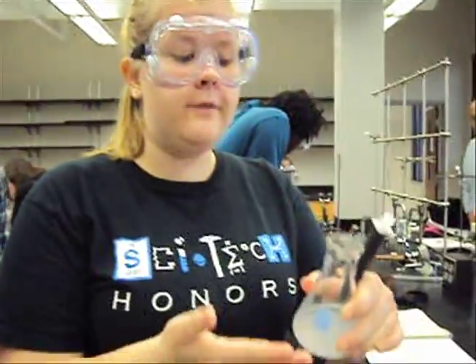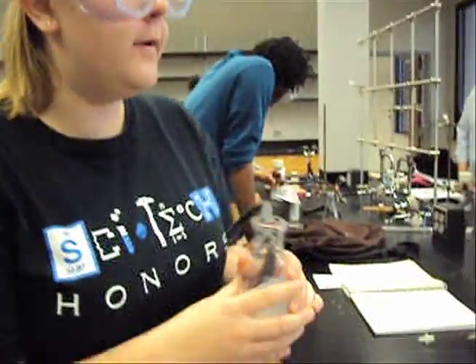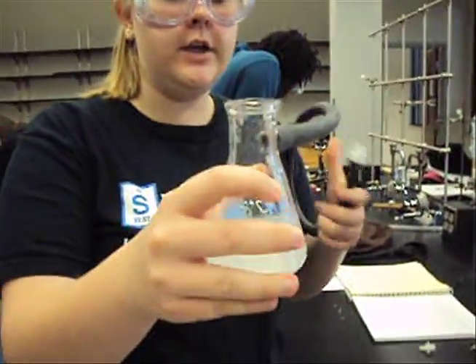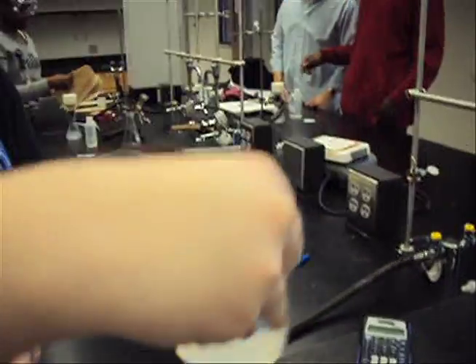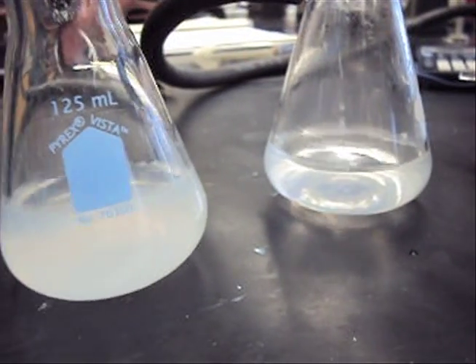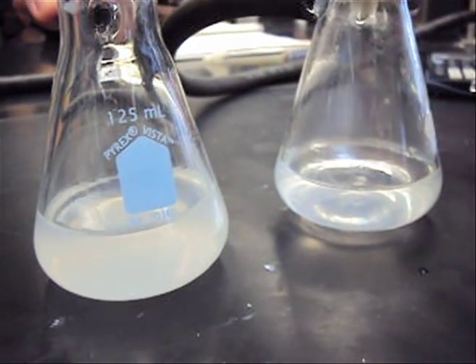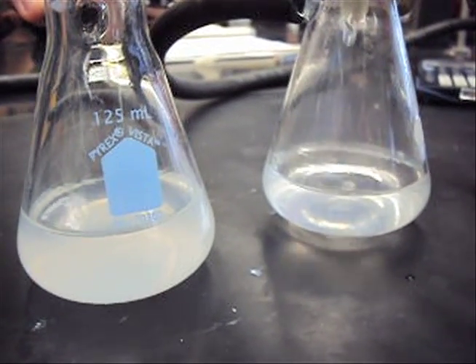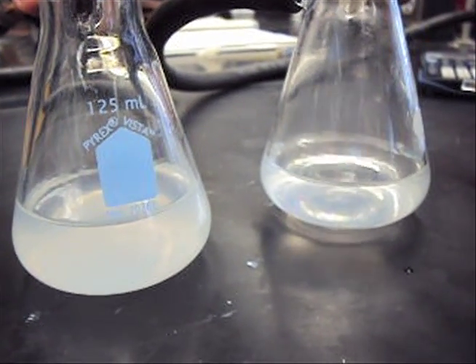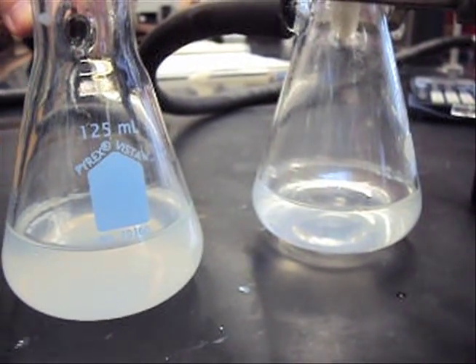Our filter flask is filled up, so we have to switch and get another one and re-filter it. We just do the same thing — make sure you swirl, collect all the precipitate, and then pour. You want the filtrate in the bottom of the flask to be as clear as possible. On the left was our first filtration, on the right is our second, and as you can see, it is much clearer, indicating a better filtration the second time around.